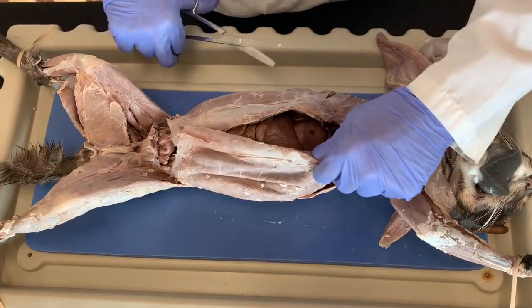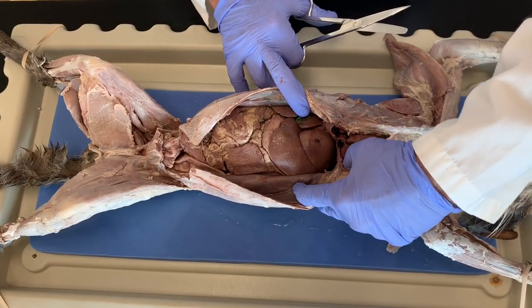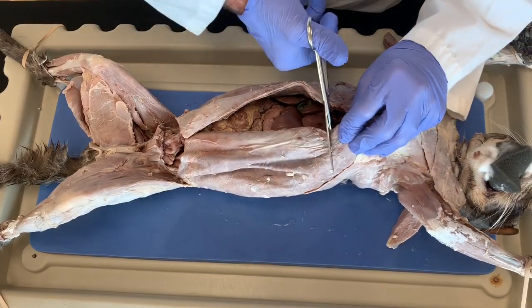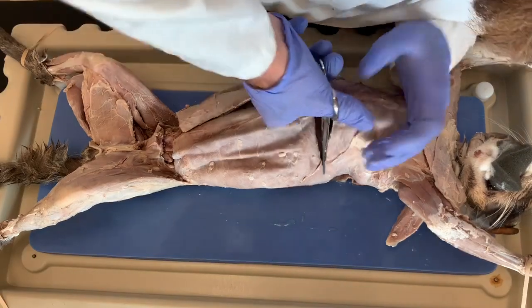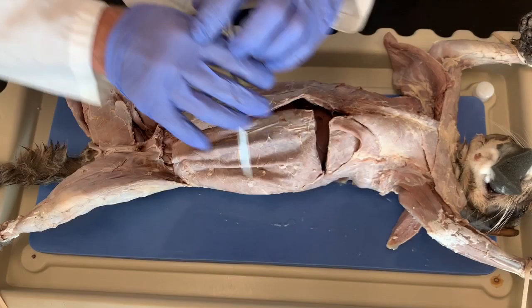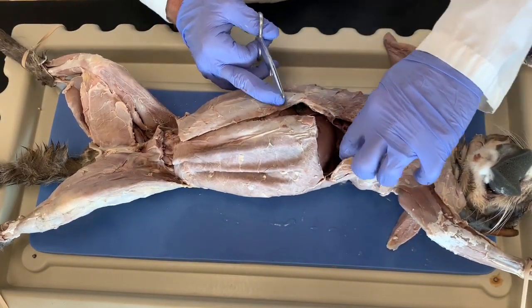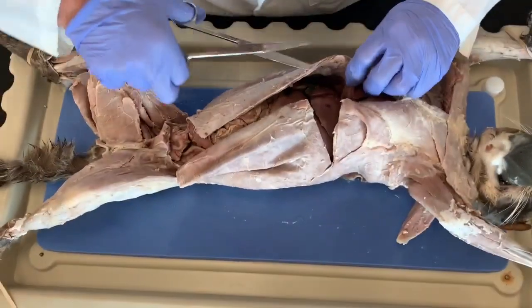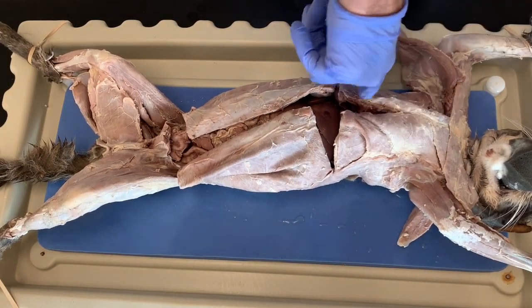Okay. So what you're seeing right on this very edge is the diaphragm. So I want to go right below the diaphragm, and I'm going to do a lateral cut across the body from the diaphragm all the way down to the side through some of the ribs. There we go. And then find the diaphragm. Again, the diaphragm here separates the abdominal cavities from the thoracic cavities.